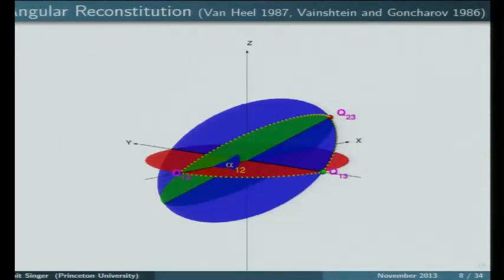So in order for us to actually determine the rotation, like I just said, we still have this 1 degree of freedom that is unknown. We can determine it by adding a third plane. From the common line of intersections between 3 planes, we can uniquely determine the relative orientations. And of course, you can add a 4th, 5th, and so on. Now, this detection of common lines is not an easy task in practice due to noise. And so one would like to find an assignment of orientation that is as consistent as possible with the noisy data.